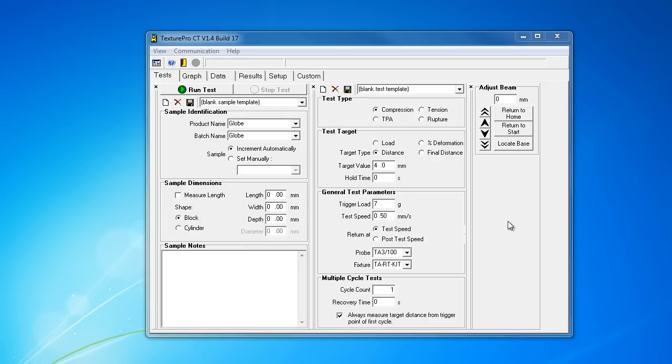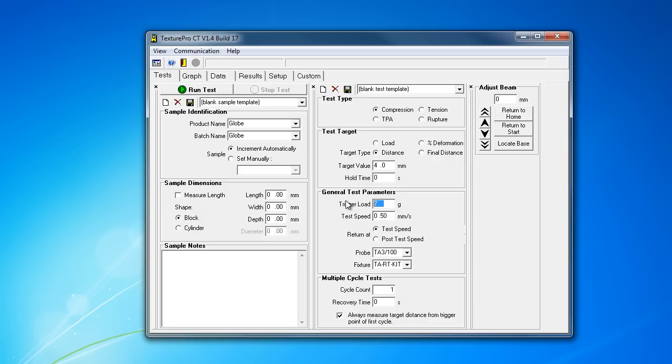That last test was a false trigger. I'm just going to bump up our trigger load here. The manual for the 50-kilogram CT3 load cell claims it should use a 50-gram trigger force. In my experience, that's a pretty high recommendation for a modern texture analyzer. You're probably going to get better data if you use something like a 20-gram.